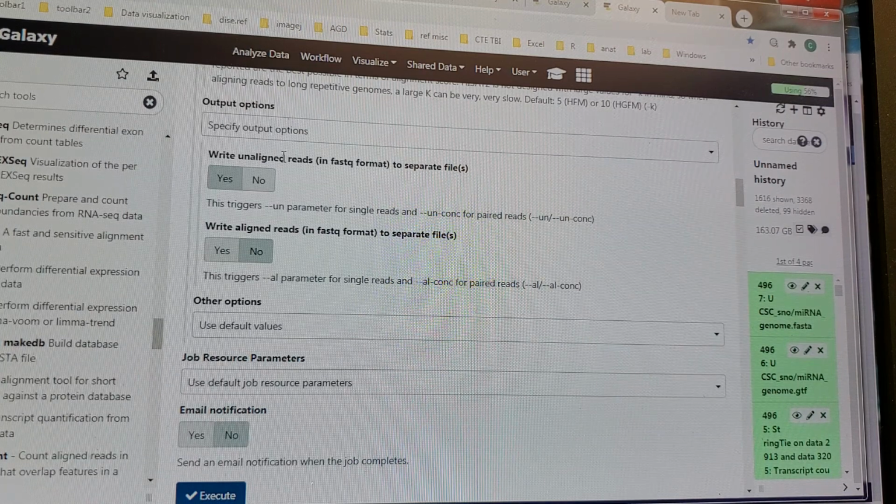And prokaryotic could be like bacteria in the lab. I always think a lot of stuff gets in the sequencing sample. Like all of the stuff I did with cows probably had a lot of my DNA in there. I would always blast to try and find human DNA.